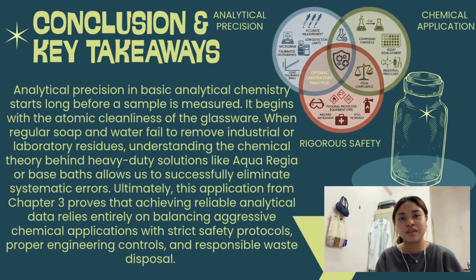To wrap up our presentation, it is clear that analytical precision in basic analytical chemistry starts long before a sample is measured. It begins with the atomic cleanliness of the glassware. When regular soap and water fail to remove stubborn industrial or laboratory residues, understanding the chemical theory behind heavy-duty solutions like aqua regia or base baths allows us to successfully eliminate systematic errors.